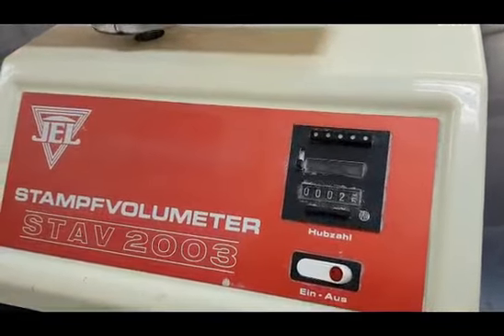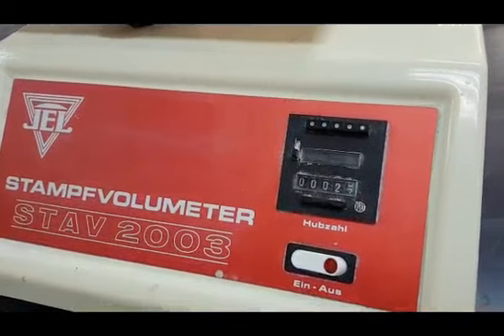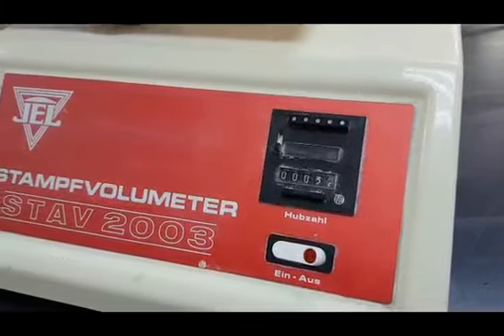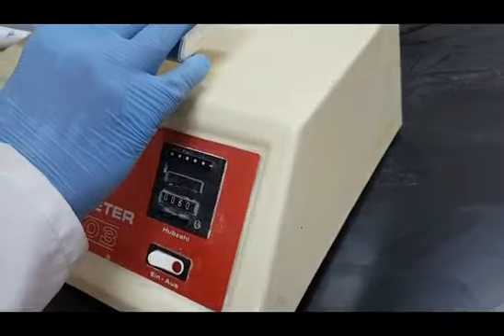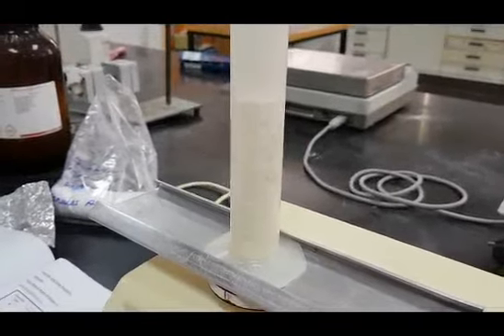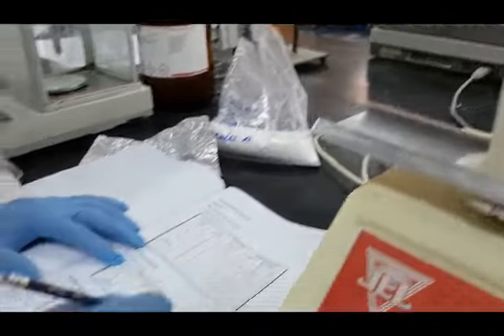Allow the system to tap until a constant volume is reached. 600 taps. Record the volume of the tapped particles.